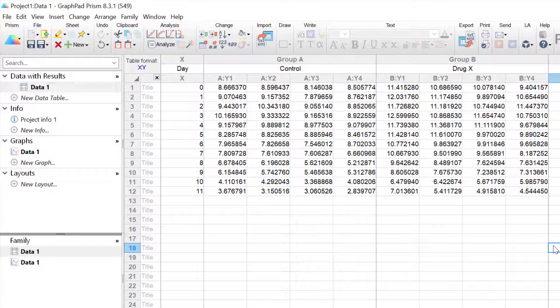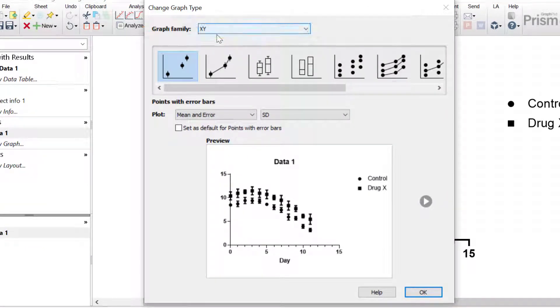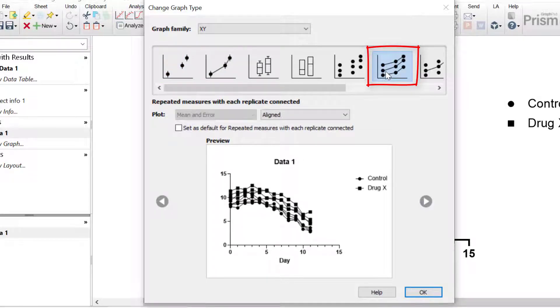To create my graph I'm going to click on the connected graph sheet in the left hand window. With the X, Y graph family selected, I'm going to select to plot the repeated measures option with each replicate connected. This is the basis for our spaghetti plot. I'm going to click the OK button.